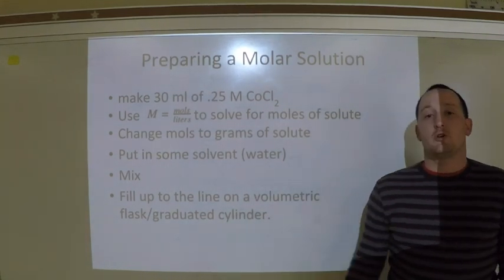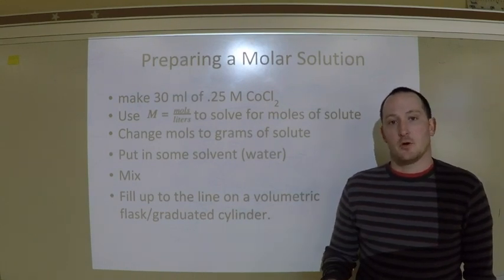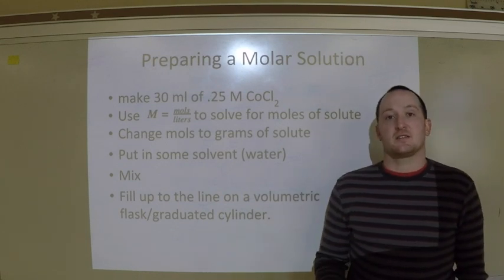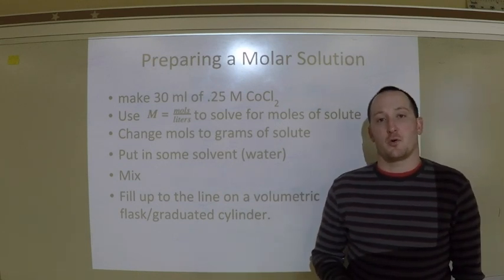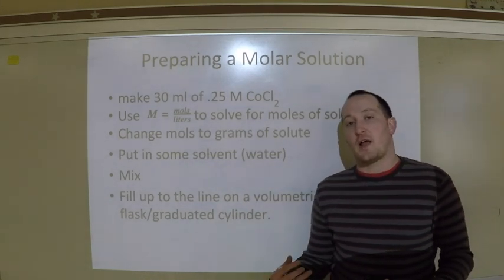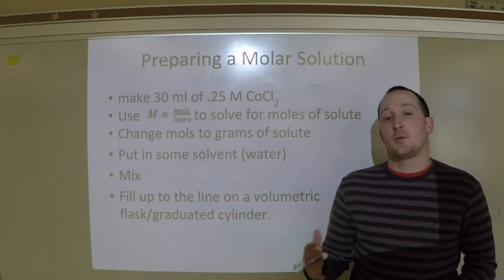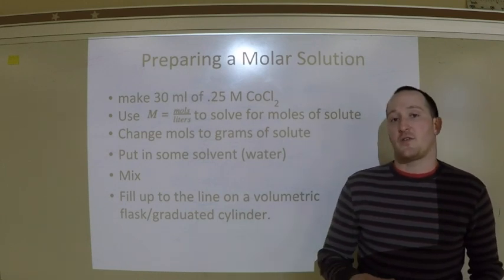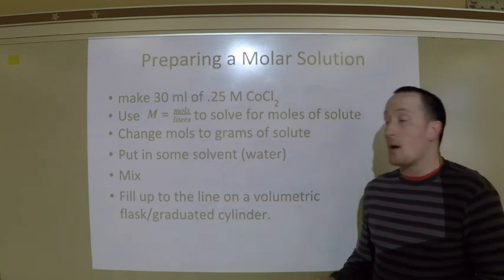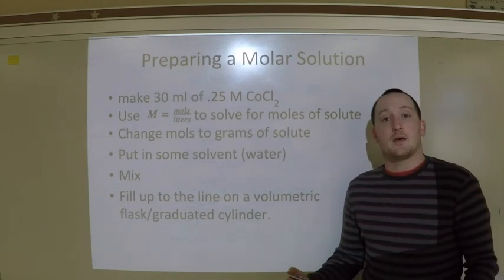What I'm going to show you how to do today in this video is how to make a solution. At the beginning of this unit, I told you that part of your test is that you're going to have to make a solution for me, so I'm going to show you how to do that right now. Since our last lesson, which was over doing calculations, how to use molarity to find moles or volume or even grams, I'm going to show you, now that you know how to do those calculations, how to make a solution.